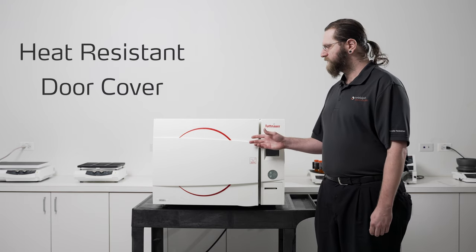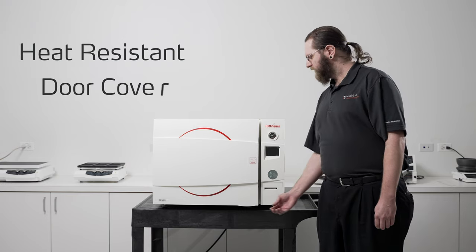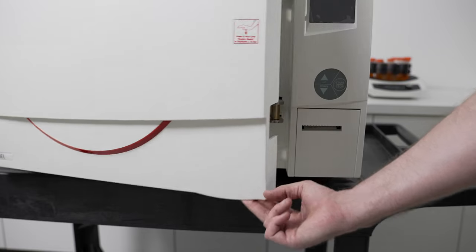Next I'd like to talk about the plastic door cover. It's made of a heat resistant plastic. When opening the door, please open it from the bottom with the recessed handle.